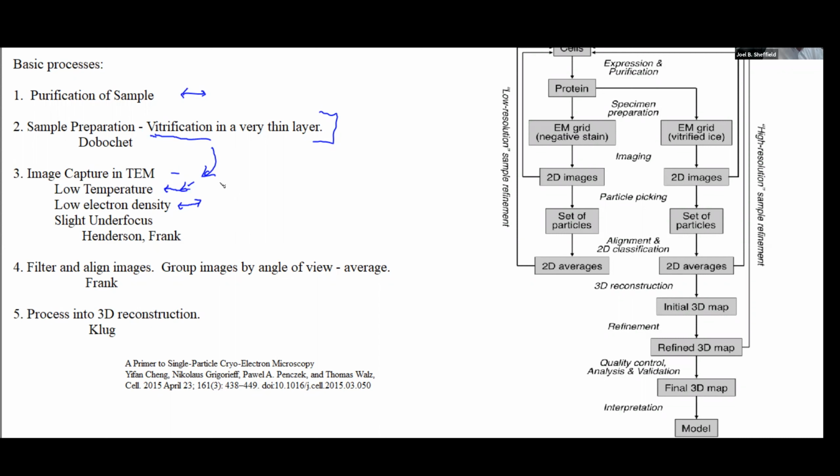And the problems are sort of obvious when you think about them. If you're using very low illumination, then you have a real problem seeing any of your sample. First of all, because you don't have the detection capability for the weak electrons. And secondly, because the difference between the background and the sample is very little at that point. And so these things had to be overcome.